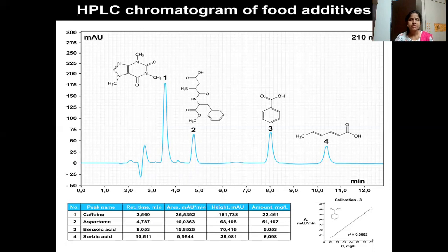That is why we say that HPLC is very efficient and high speed. Everything is programmed, and you will get a neat picture of the various components present in the sample. So this is about HPLC, the principle and the different instrument parts present in HPLC.